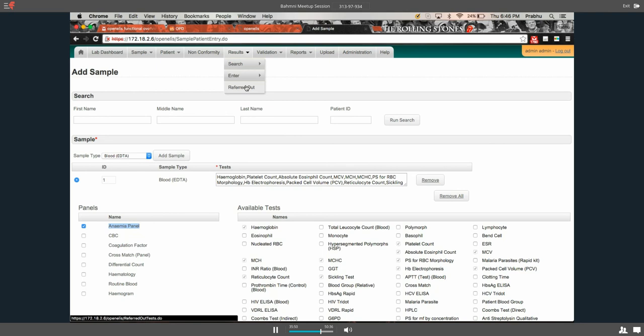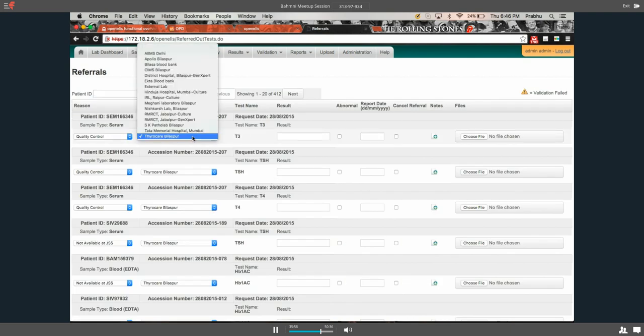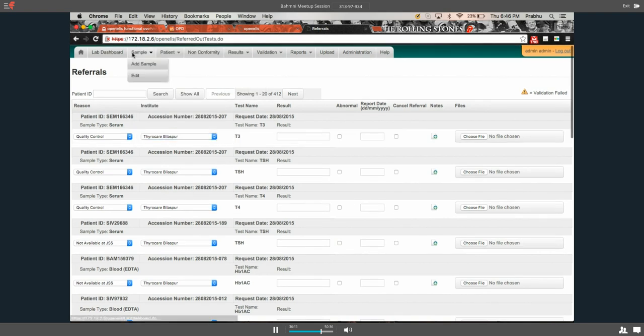And the referred out tests, so if you can see, these are the institutes or organizations that we have configured already. So you can select it from here. This is how the organization name comes up here. And if you have to enter, sorry.